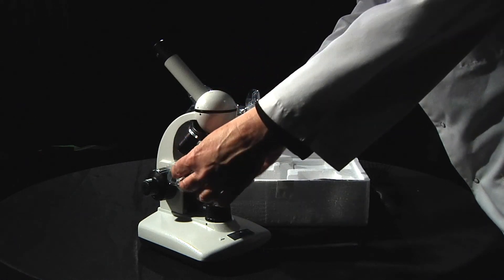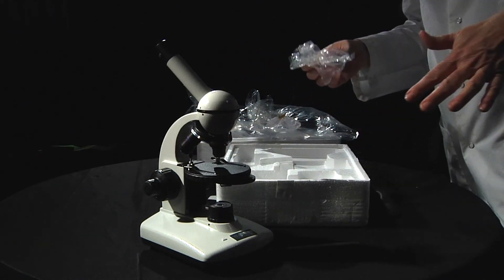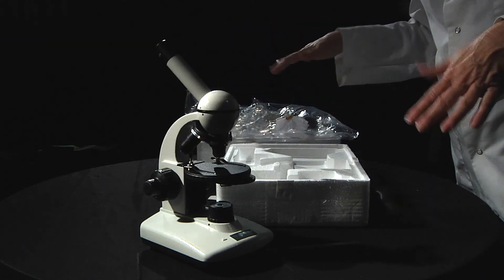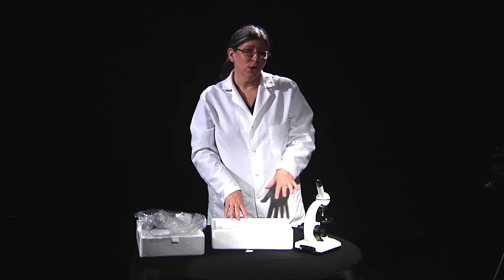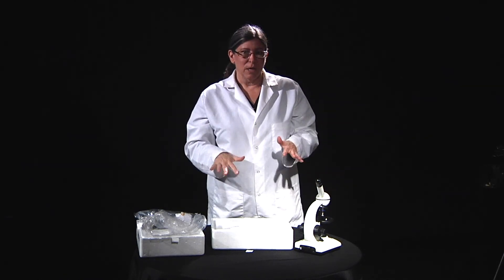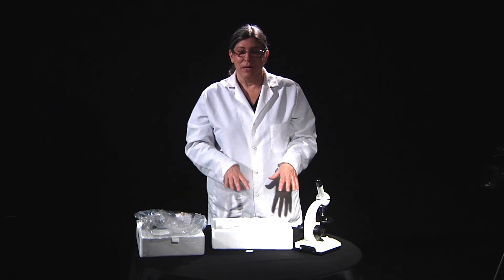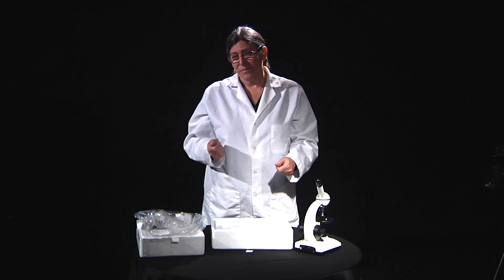There's also a plastic cover on the stage — at least mine is; yours might not have this depending on the circumstances. So this is the microscope. I strongly suggest that before you unpack your microscope like I did, you take your phone out and take a picture of it, because it's a little bit hard to put everything back in the box without destroying the styrofoam packaging. So take a picture — that should help.